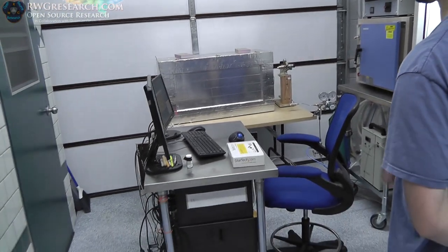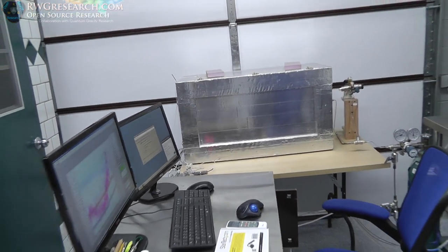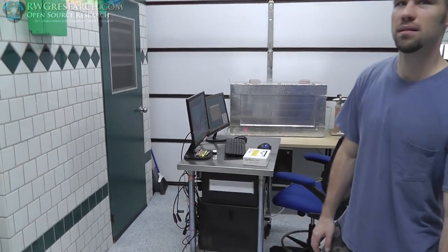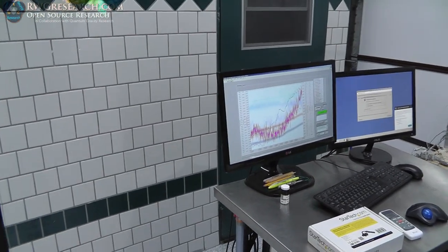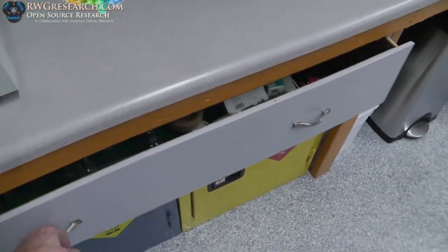That's cool though. There's the calorimeter box. Are you still running it? Yeah, off and on. You have a heater in here? No, but I do have this set at 82, and so it's hot. It's because I'm actually trying to monitor whether or not the room temperature swings, and we just put the AC in. I'm testing it. And then here's all of our glassware.